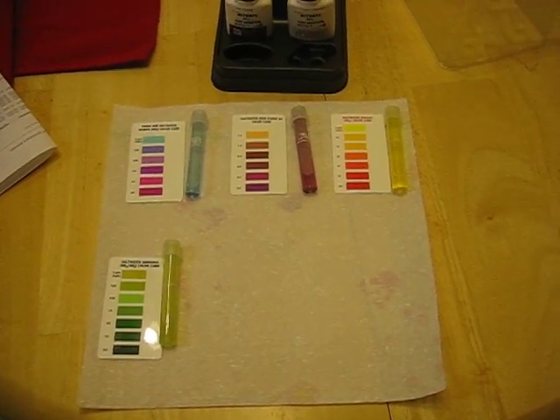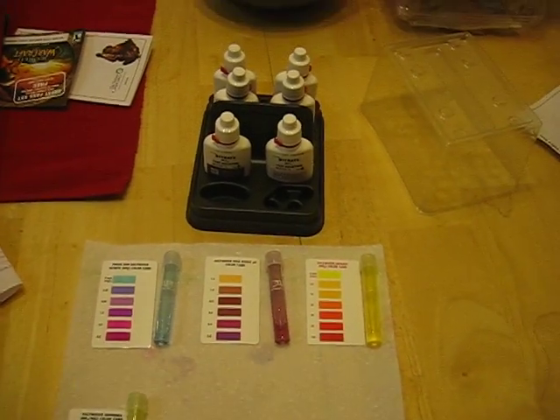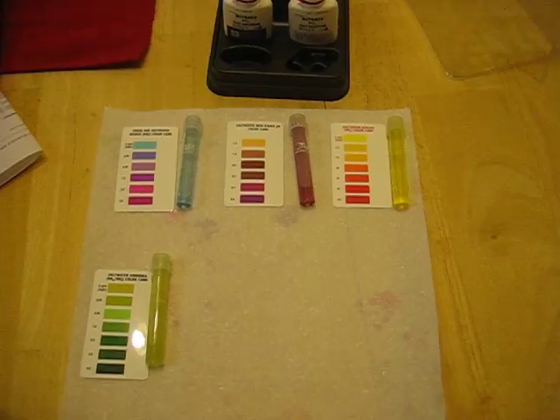I did want to go ahead and show some of the results here for the API saltwater master test kit from my nano lagoon sleeping quietly over there.